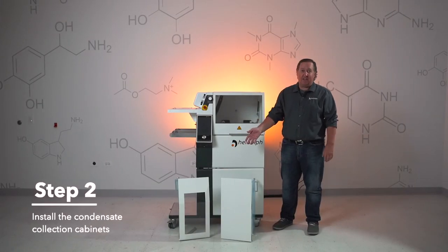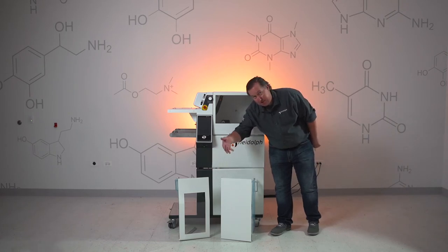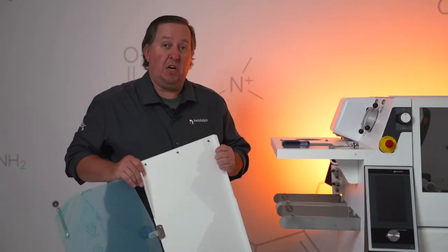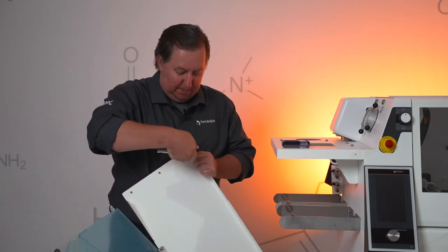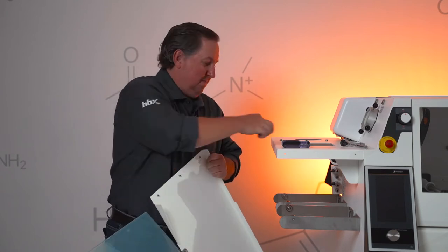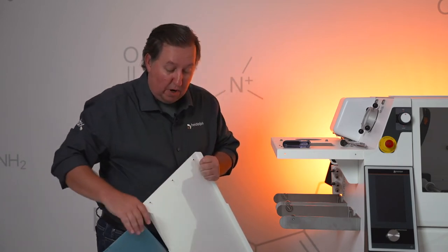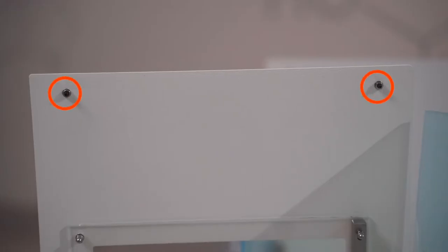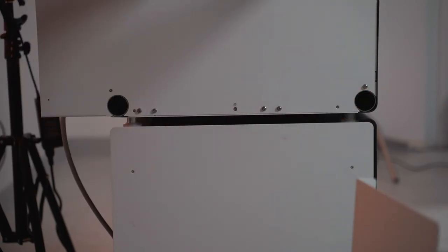For step two we're going to be installing the condensate collection cabinets. We have a panel that goes up on the front that has a clear glass so you can see in, and the solid panel will be going on the rear of the unit. First thing you're going to want to do is install the back panel. Take your five millimeter socket and loosen up these screws. You may also want to remove the two that are on the front panel as well. Next we're going to remove these five screws right here — they are a size T15.